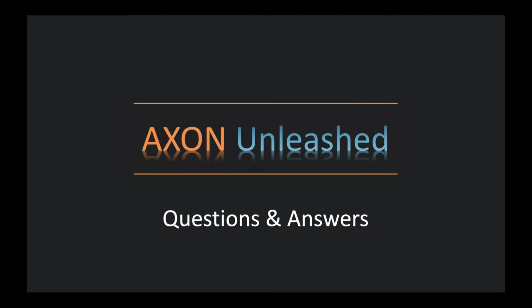Yeah, that's a great question as well. It's probably the most common question that comes up. And so maybe the best way to describe it, so there's two factors when you think about drift. The field of view, I won't say magnification, but let's call it the field of view. How narrow or wide is the field of view? And then the update rate. And what I mean is, how fast are we getting images, whether it's in TEM or STEM mode. And TEM mode, you would expect most likely a faster rate than STEM mode. So those are the two key factors.